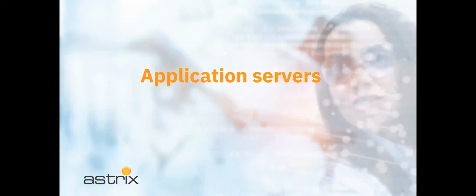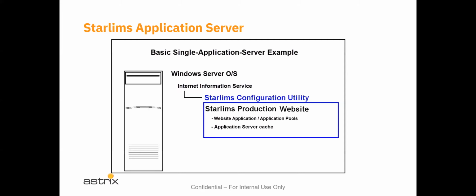So the first thing we're going to talk about are the application servers. In a basic single application server example, we have a standard Windows server. It operates on the Windows operating system software. And we have to have the Internet Information Service application loaded onto that application Windows server.